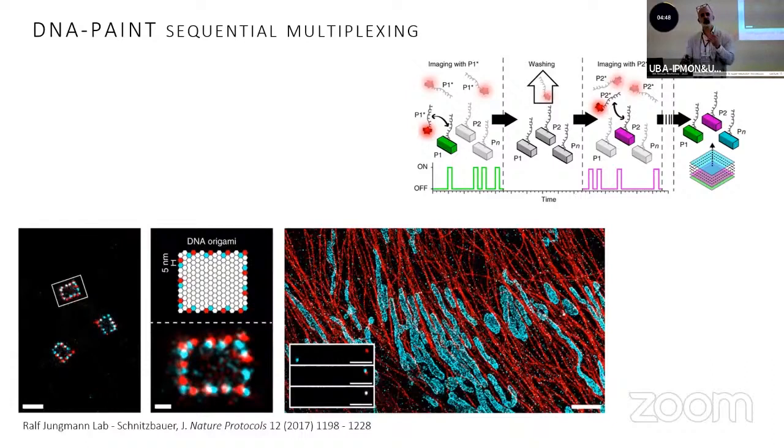Once you have collected enough positions of that protein, you rinse and you inject the next imager with the other DNA sequence, right? And this one will bind to the other protein. And now you again measure until you collect enough positions of that second protein. And after that, you can reconstruct a 2-color image, okay? With a 1 color microscope.